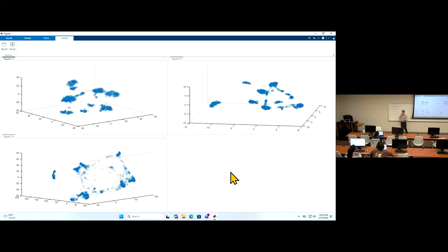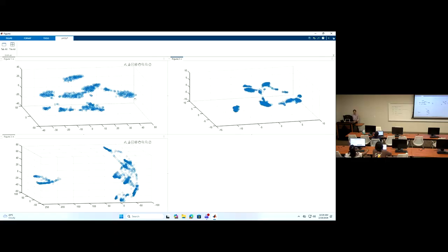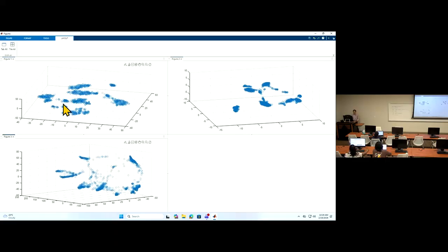So it's based on the implementation algorithm behind each of these. It gives you a different view, but the same information from exactly the same input. I also showed you that if you use the toolbox through the interface, you have this function: remember last time, if you highlight this group of cells, the corresponding cells in the other group are highlighted.